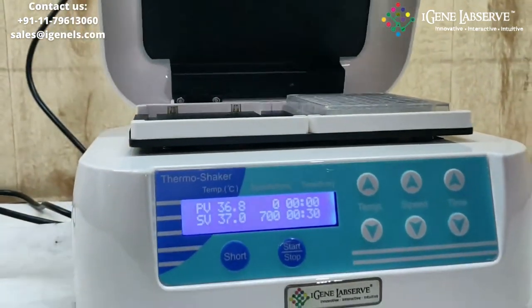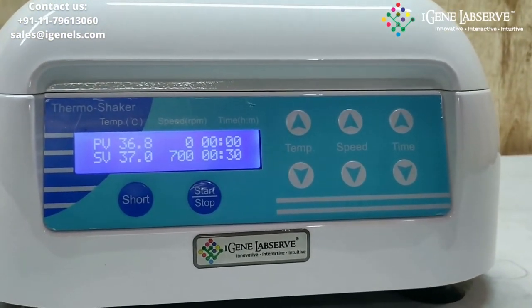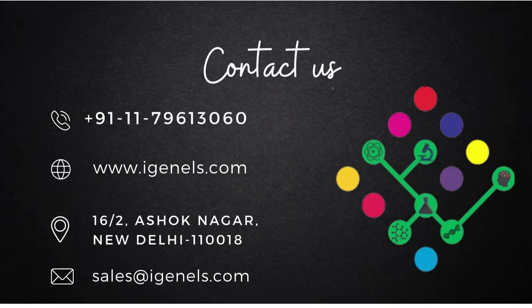This is how iGene's microplate incubator shaker works. Thank you.